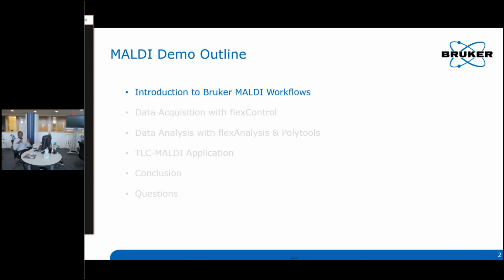So we'll go ahead and acquire some data, and process it through every software that we use, and just show you everything that we do for polymer analysis.